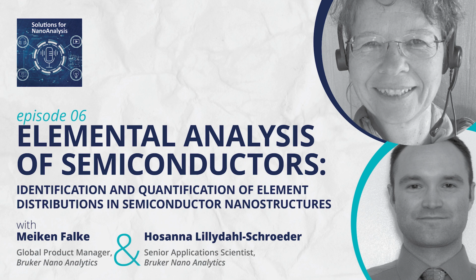I mentioned. Use the good of both sides, EELS and EDS, maybe cathodoluminescence for 3-5 semiconductors, or combine EDS and diffraction techniques, like, for instance, also orientation mapping, EBSD and orientation mapping in transmission, like TKD, which Bruker also offers, and look on where grain boundaries are, where the diffusion pathways are in a device. One can see that with TKD. And if the orientation of particular functional layers is the one we want to have, and if there is the right combination of elements in that functional layer, that can be done in combined EDS and, for instance, TKD combined, and that again in SEM. So there are lots of ways for the future.